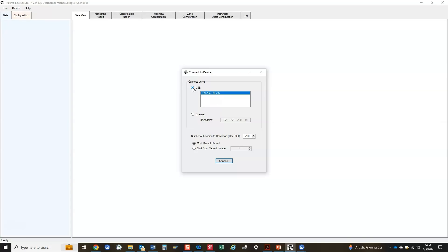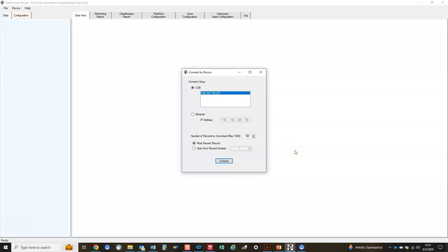When an instrument connects to TPLS, sample data and the instrument's configuration will be imported into the software. Due to the large sample buffer on the Aerotrack Plus, it can store 250,000 records. The number of records that can be downloaded are limited to prevent extremely long downloading times. By default, the last 200 records collected will be selected for download, but this can be changed here if desired. With the connection method and sample records to download selected, press the Connect button.